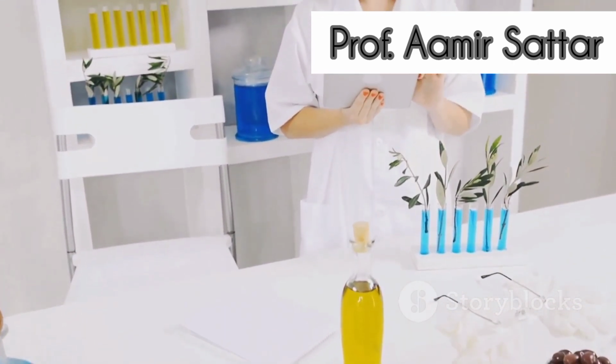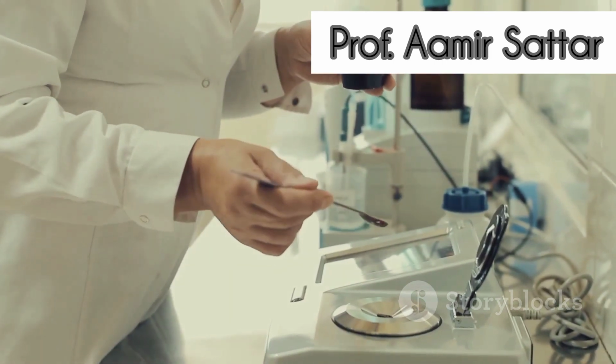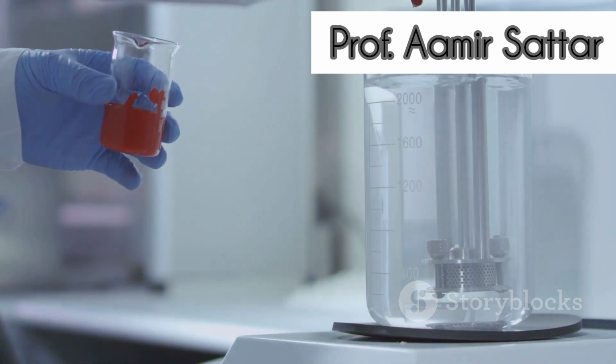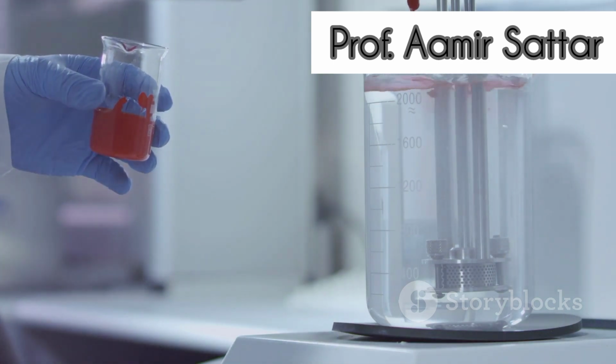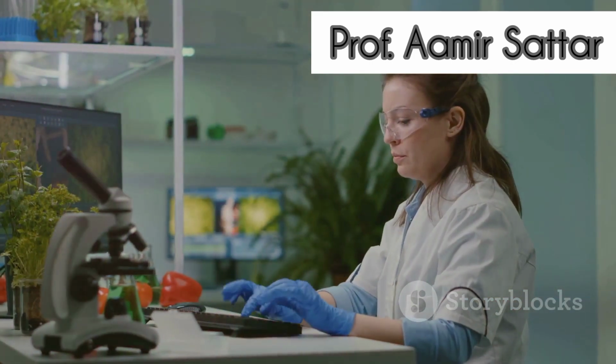Next, we have the Fehling's test and Benedict's test. Both these tests involve adding specific reagents to the food sample. The appearance of a red precipitate in either test is a clear indicator that carbohydrates are present. But not all carbohydrates react the same way.